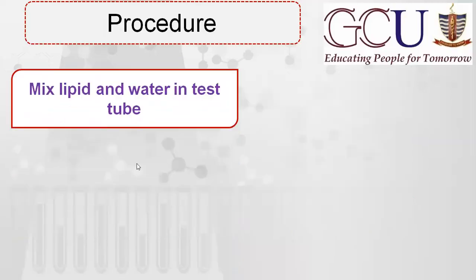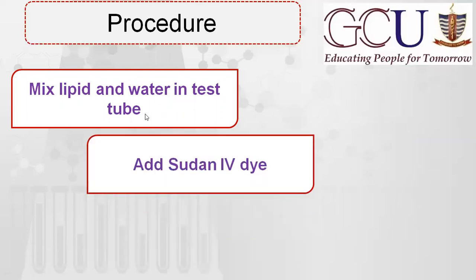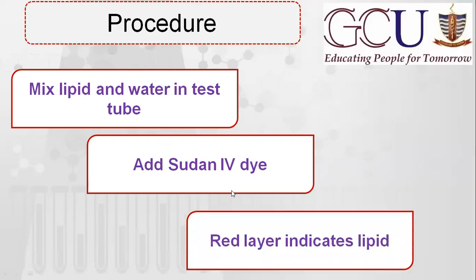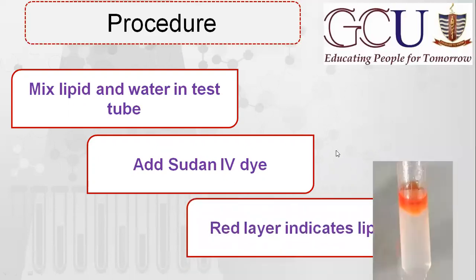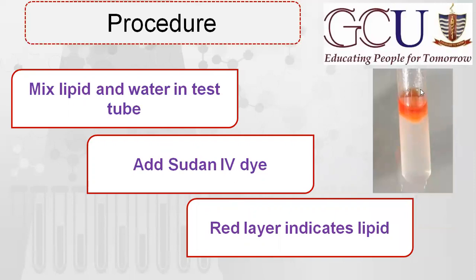To perform the test, mix lipid and water together. This forms a separate layer of lipid on top of the water. Then add Sudan 4 dye. The upper lipid layer turns red, forming a distinct reddish-brown colored layer. If this colored layer appears on top, it indicates the substance is a lipid. The lower layer is water, and the upper stained layer is the lipid.